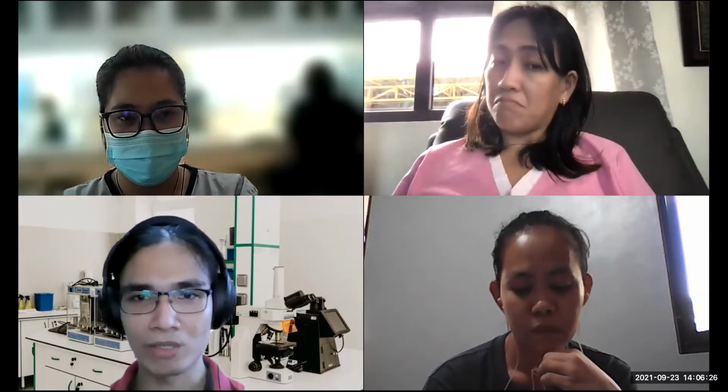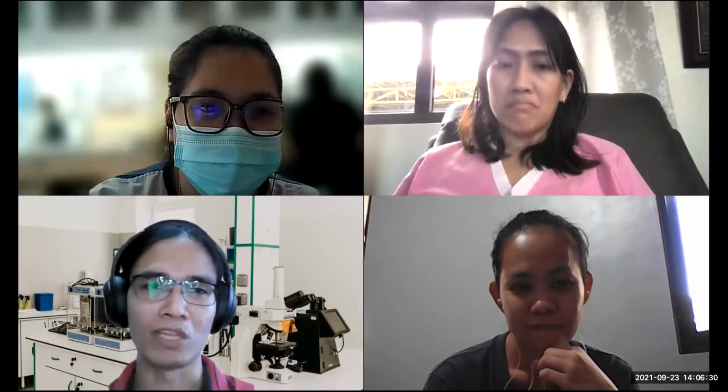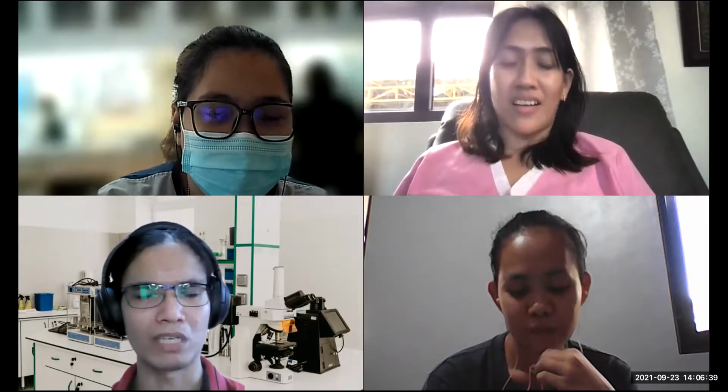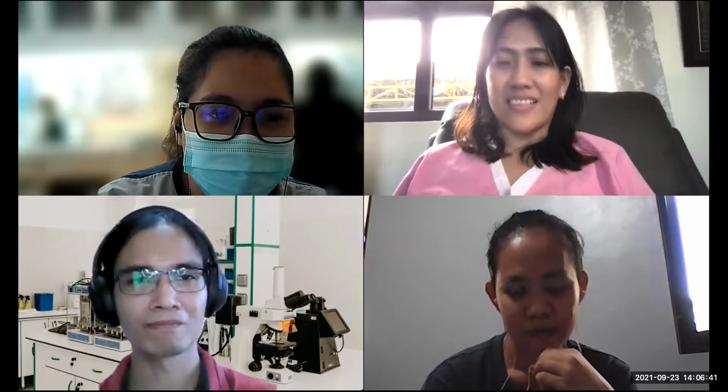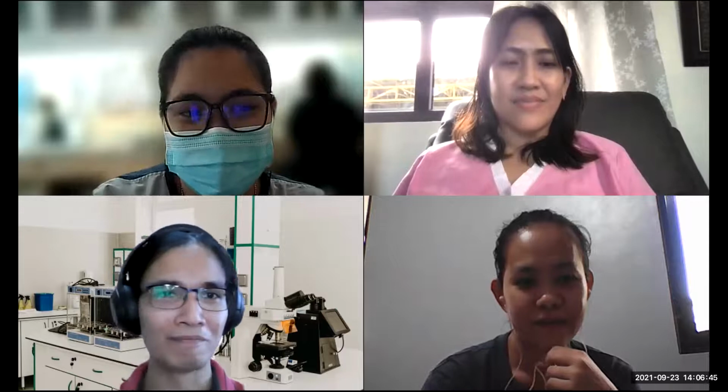I've not tried it personally, but theoretically you can do 20 minutes. But usually, by experience, it takes 1.5 hours to 3 hours at most. Conventional, longer, can take you 5 hours.